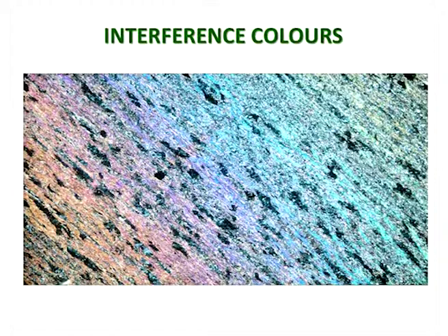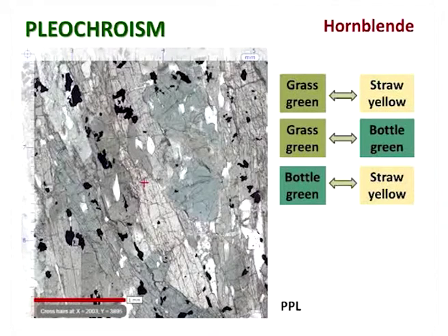And that particular change in colour there, from a kind of orangey yellow right the way up to pale green, very pale green, through blues and pinks, that is purely a result of a very badly made thin section, which is much thinner down in this lower left-hand corner. So it's showing much lower order colours and much thicker up in the top right corner. So essentially it's a kind of wedge-shaped thin section, not very well made. So let's have a look at some interference colours.